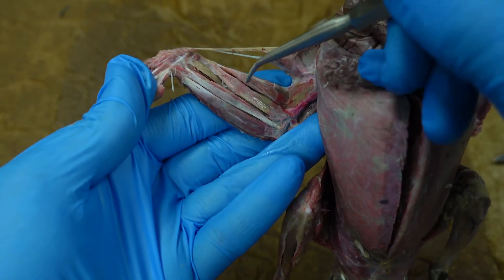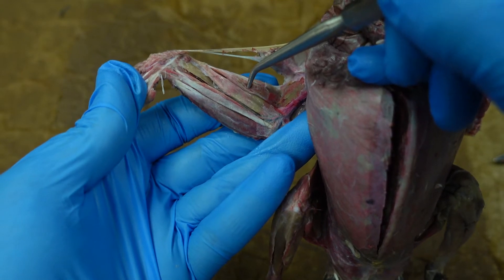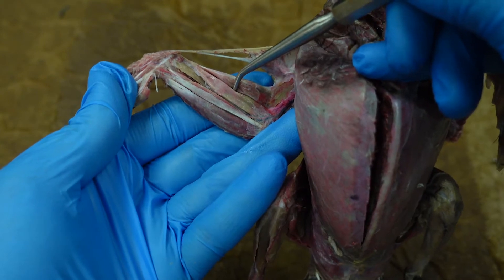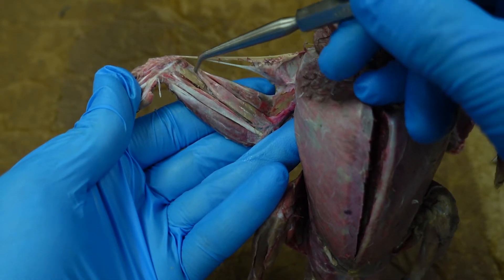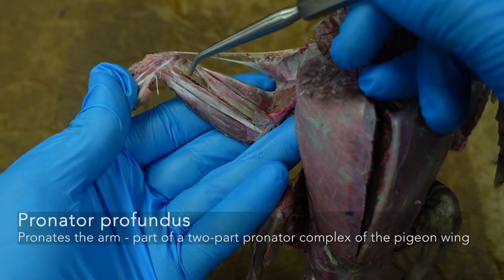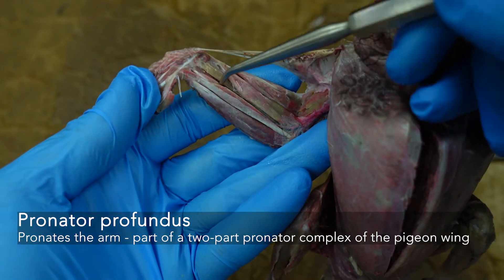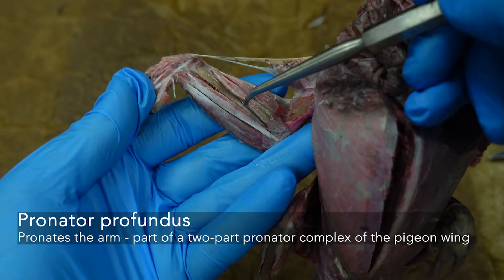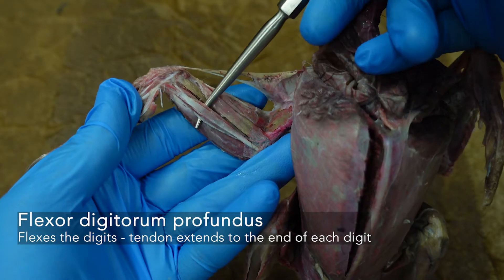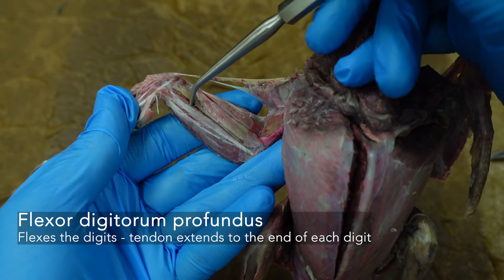Moving from anterior to posterior, we have the extensor metacarpi radialis. Then we have some strong pronators here — a two-part pronator superficialis and pronator profundus. The profundus in this particular bird is that brownish color; it may not look that way in yours, but this is the layered profundus muscle. Then we have flexor digitorum profundus, whose surface is covered by a tendon — you can leave that in place, kind of like a tendinous sheath.